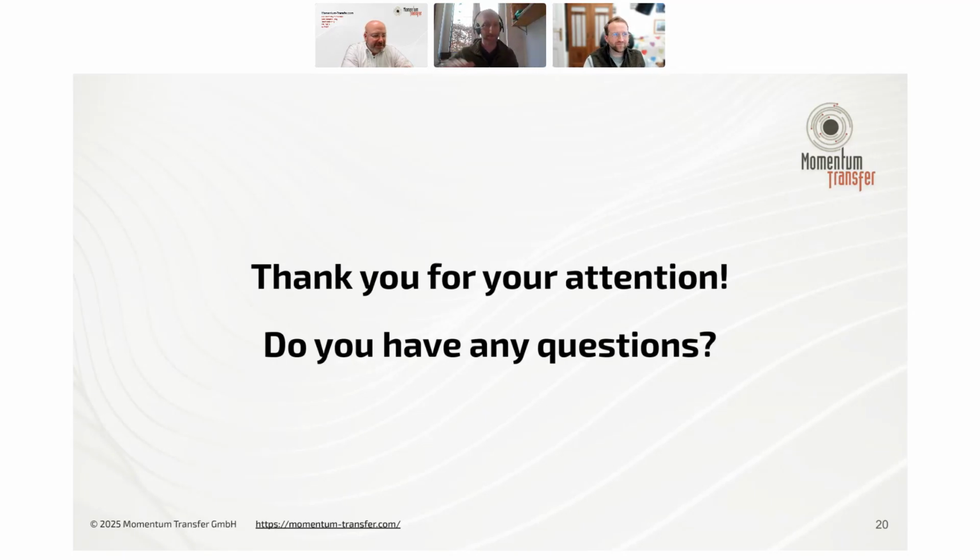Yeah, no, absolutely. Okay. Are there any limits on its use with external data? Can I advise the students who use my lab to use it? I think yes, right? If there are limits beyond what we've already discussed, we maybe don't even know what they are yet. So feel free to explore and find those limits.